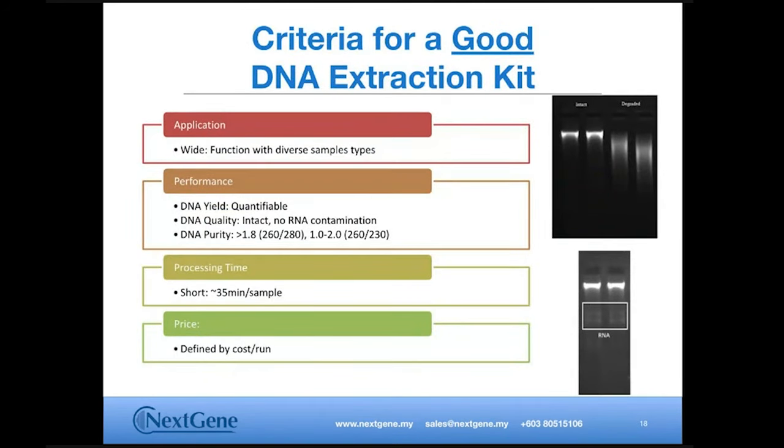So there are many kits in the market out there, but I have deduced a few criteria for a good DNA extraction kit. Starting with a wide range of samples, for example, the extraction catered for soil should be suitable for all kinds of soil, for example, clay soil, organic soil, sand soil, and others. Next, based on performance, we are talking about yield and purity here.